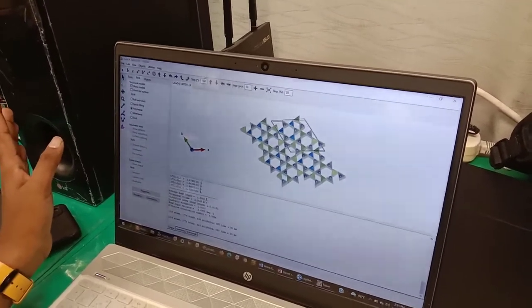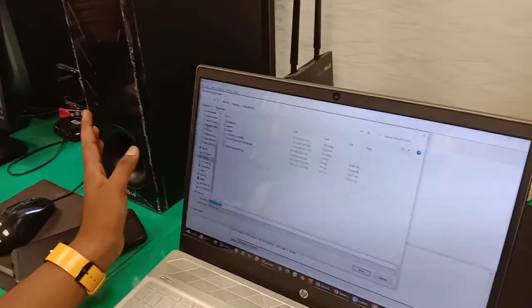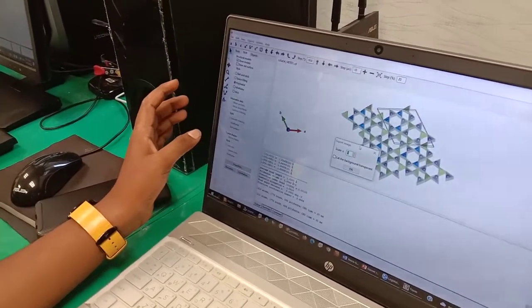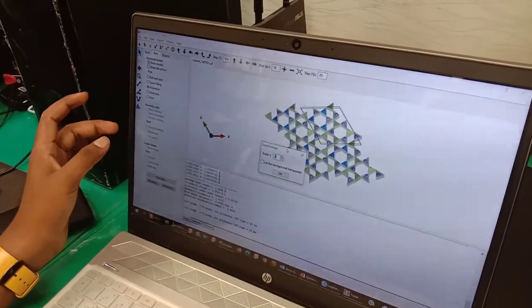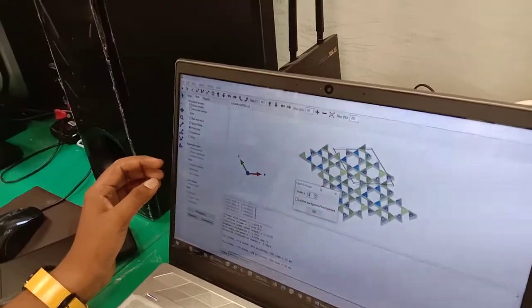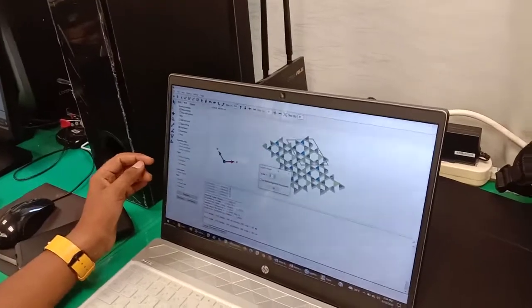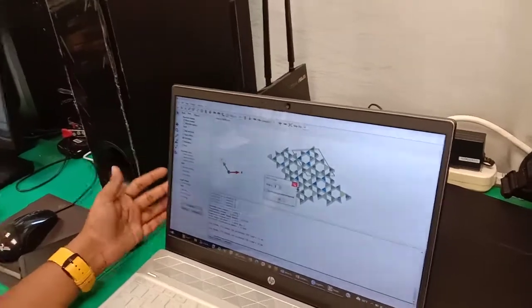When you want to export, you go to File and say export raster image, and save it as a TIFF. Now it will ask you for scale values, so you can choose whatever scale you want. If you choose a higher scale like 5 or 6, it will take some time, the file size will be much bigger, and the image quality will be much better. If you choose 1, it will export in a very short time, the image may not be so good, and the size will be less. That's it.